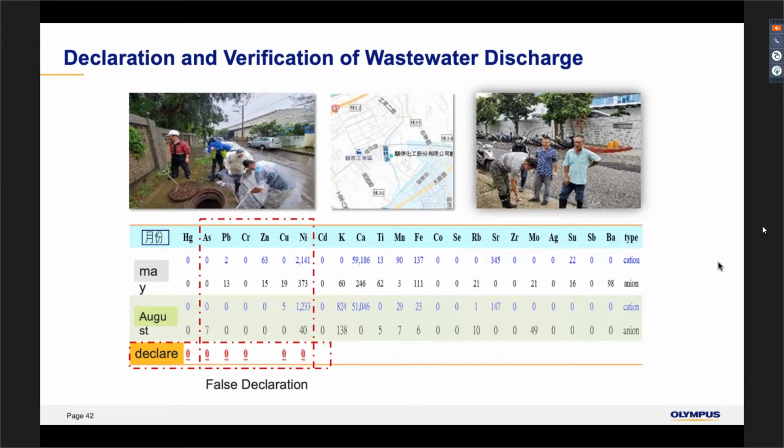How to ensure that the sample is homogeneous? Yes, we analyze 4 or 5 times at different points of the resin surface. And this gives us the confidence that the readings are almost the same. So I think it is homogeneous. Yeah. So Prof, I mean the heavy metal concentration is evenly distributed on the surface of the resin.